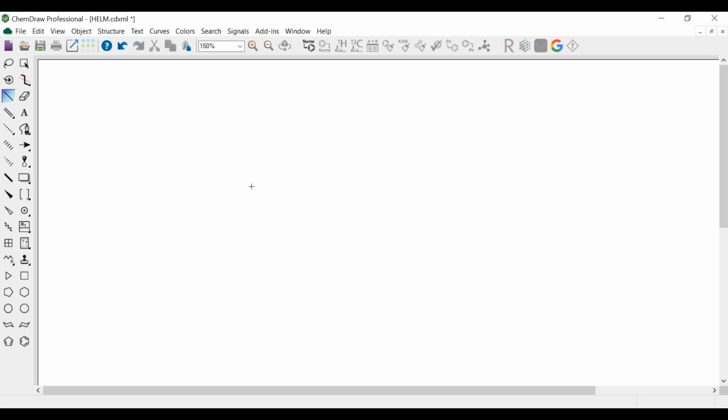So we're looking into things like cheminformatics and those sorts of areas, and how do you interact with content like that? Most of you that are experts with ChemDraw, if I asked you to draw a molecule, benzoic acid, for example, none of you needs help figuring out how to draw this. You know that we've got the drawing tools that make it really easy. We've got our hotkeys. I could have made it extremely easy by using the name to structure, right? Benzoic acid, and then name to structure. These things are old hat to most of you.